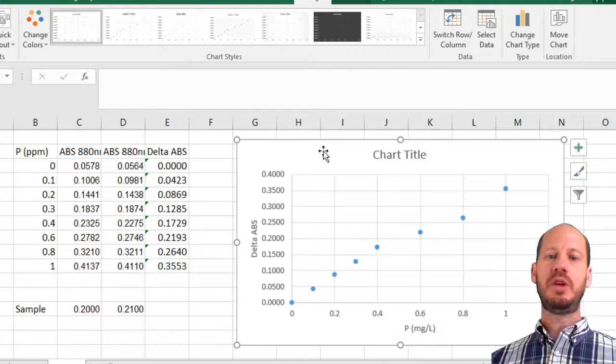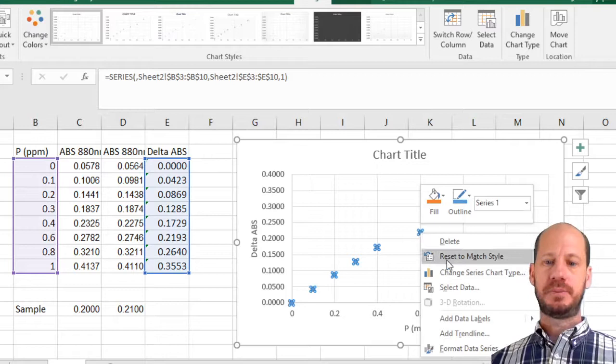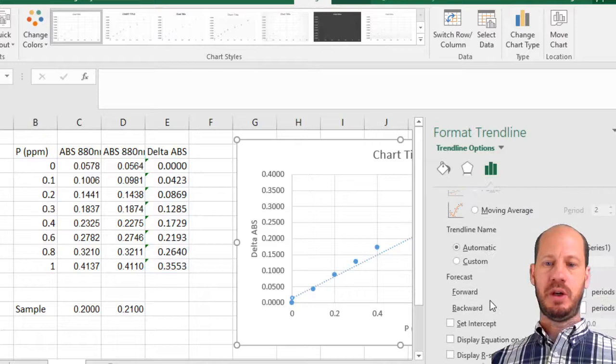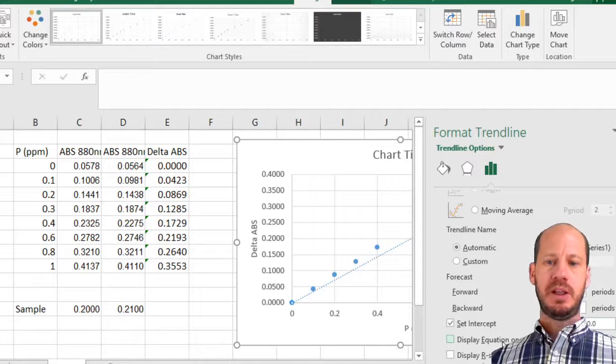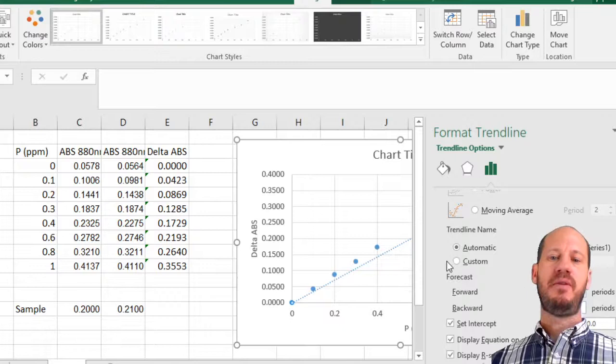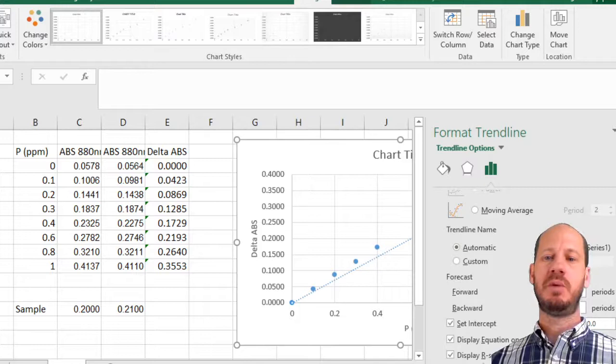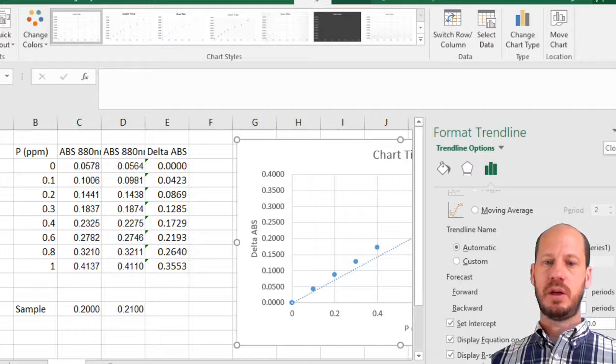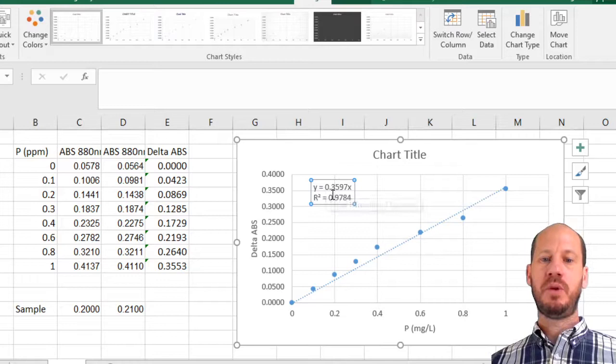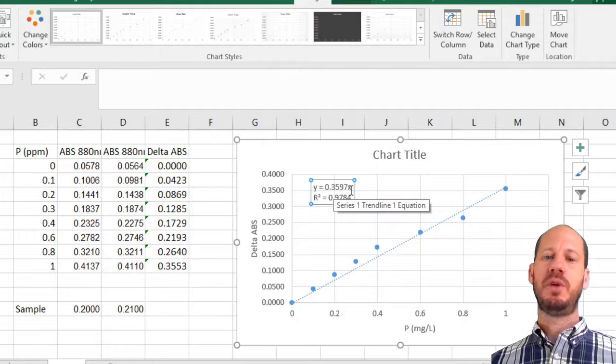How do we use this to calculate the concentration in our samples? We need to add a trend line. You need to fit a line to this curve and know the equation of that line. We're going to choose linear. Set intercept at zero, display the equation on the chart, and display the R-squared value. The R-squared tells you how good your fit is. If it's closer to one, you're more precise. If you're becoming below 0.95, it's becoming a little bit strange and you cannot trust it too much.